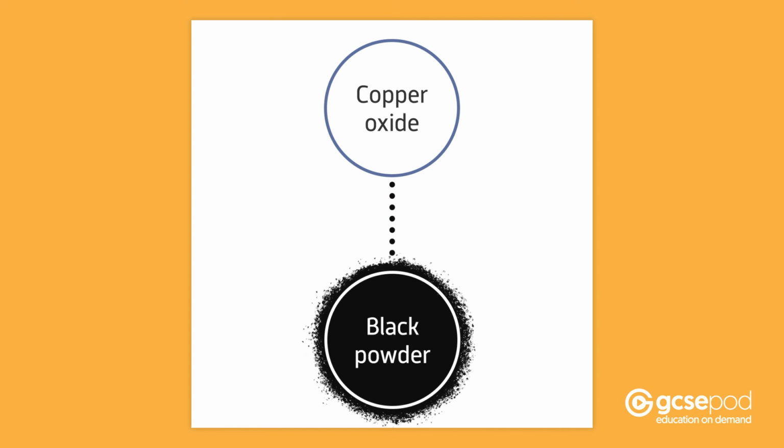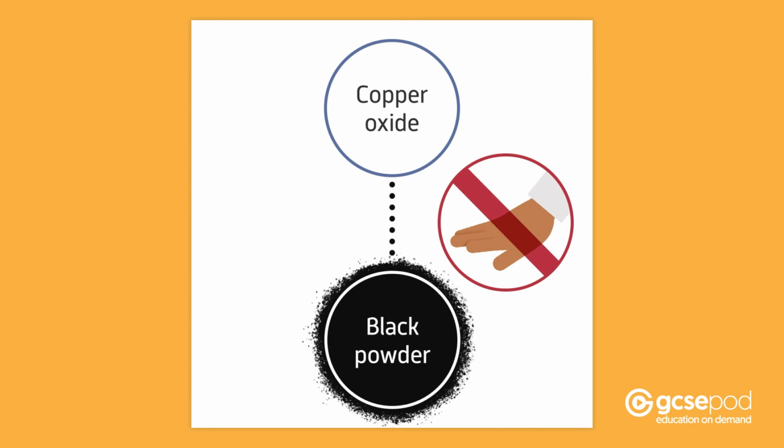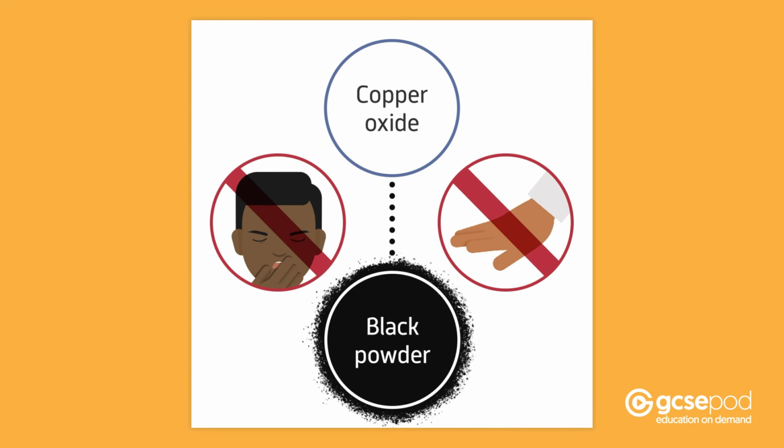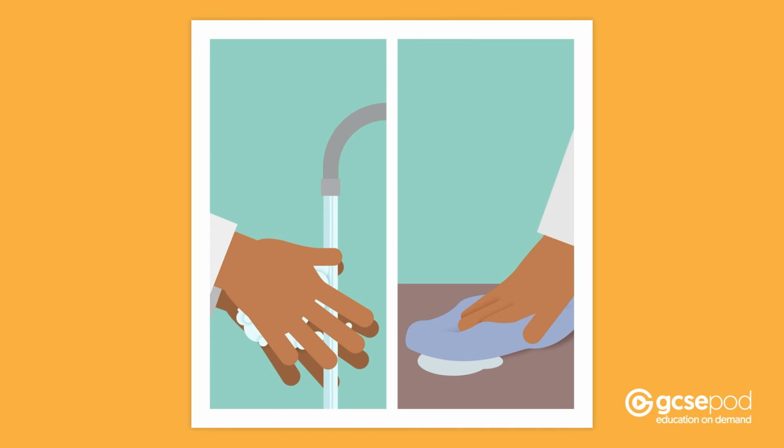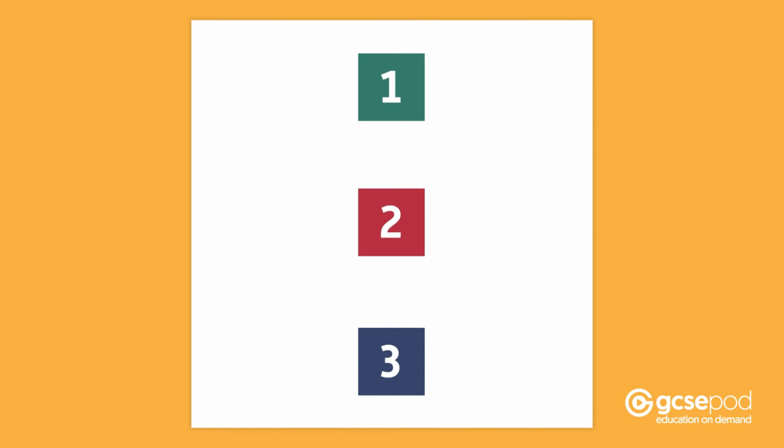The copper oxide is a fine black powder. Be careful not to touch it with your hands, and make sure you do not blow or sneeze into it, as this could lead to it being inhaled. Again, any spills on the skin should be washed off immediately, and any spills on your bench cleared up. The method can be divided up into 3 steps.